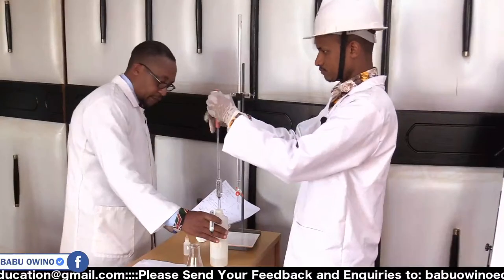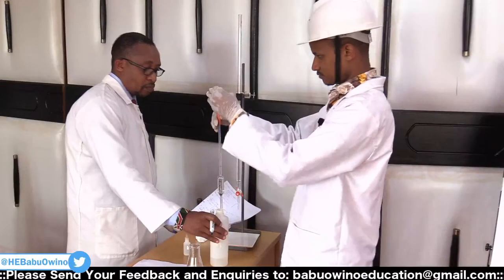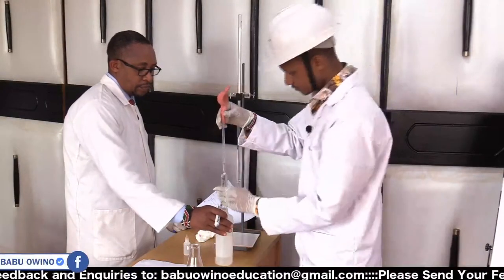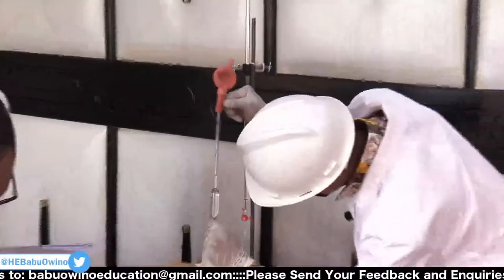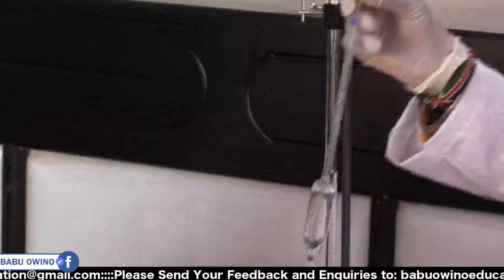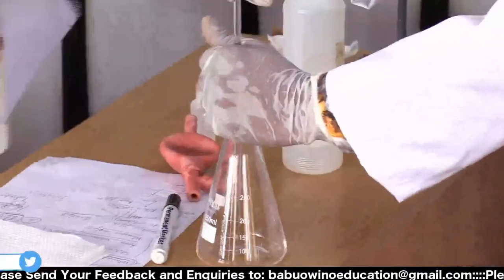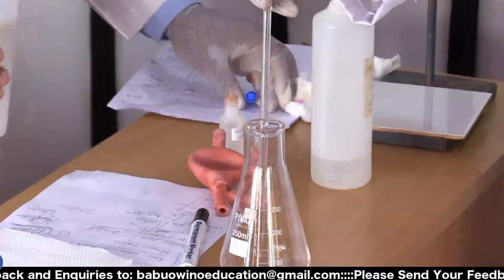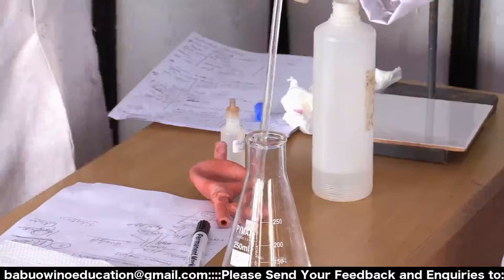That's 7.40. Sorry. So you be very careful, class, in rinsing your apparatus, because it might affect your next practical. So some of these things we decided to do the second practical to let you know how you need to move on to be accurate. Because if you just do it, you will find very big values, difference in values. So we are doing this also intentionally to explain to you, such that when you find different values with different variations, then you see how to work it out.